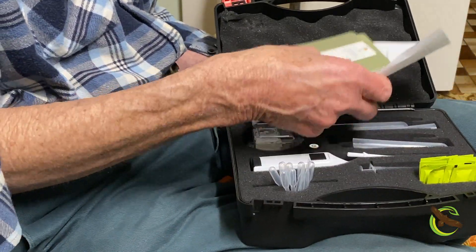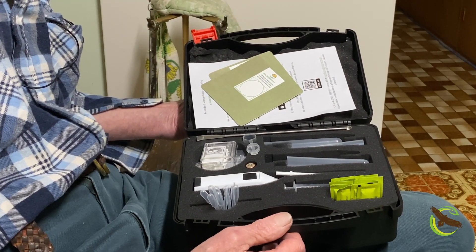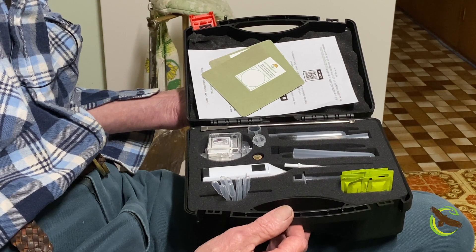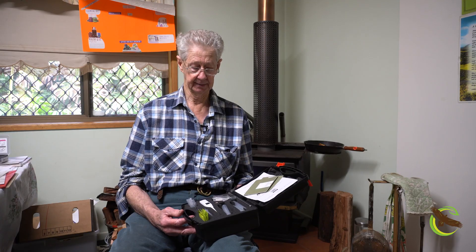It comes in a kit like this with all the auxiliary equipment necessary for the job. There are 10 tests in a starter kit. Once you've used those 10 tests up, you can buy refill kits of 10, 50, or 100 tests, and they work out very economical to use. They're approximately $280 including GST, and we are the distributors for Australia and New Zealand for these kits.